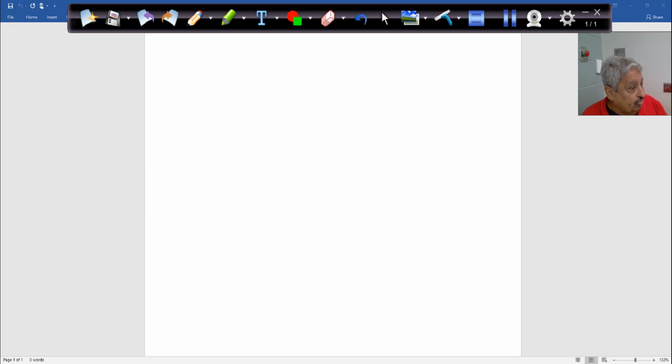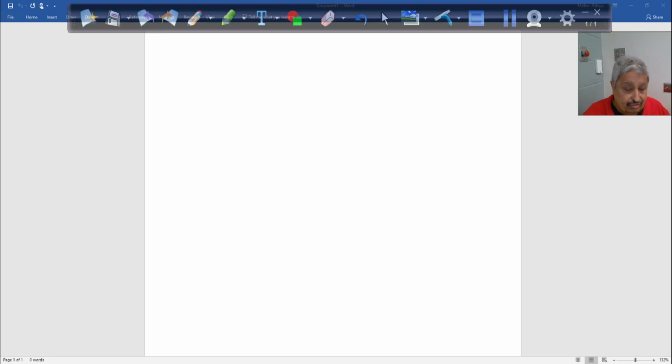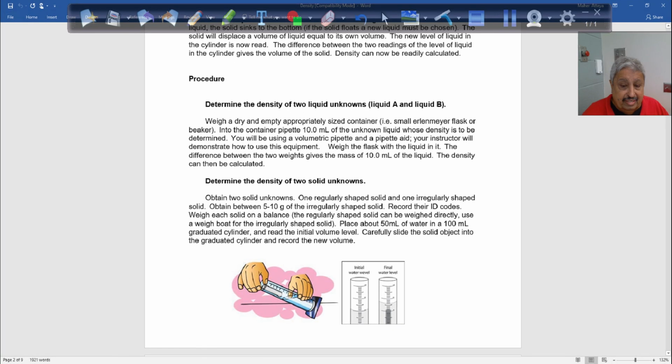So if you get close to 3, you have to go and look at the web to see which metal element that is. About 3, close to 3, that's aluminum, correct? Around 9, that's copper, correct? That's the issue I have with the time. The time is not really good for this.